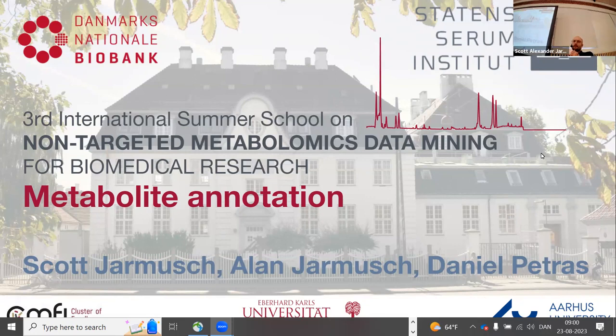So the past couple of days, you guys have had the experience of first day walking through basics of mass spec, some introduction to some of the concepts in FAIR data and all of these processing workflows, quality control. Yesterday, you guys had an intense hands-on pre-processing, an essential aspect to working with any type of mass spec data, especially large types of data. And now we'll move on to the natural next steps today.